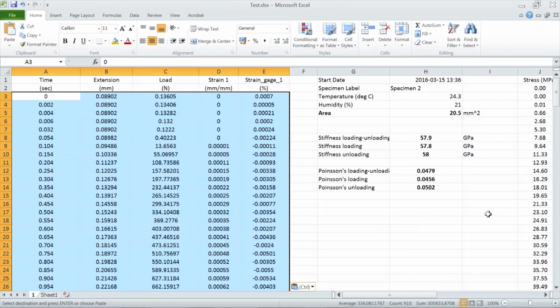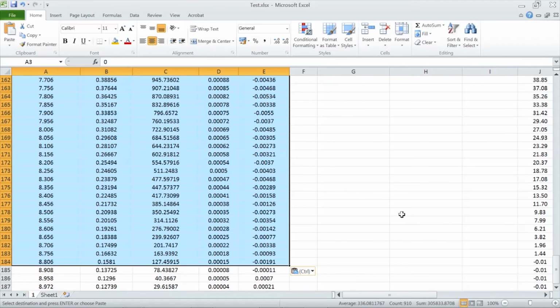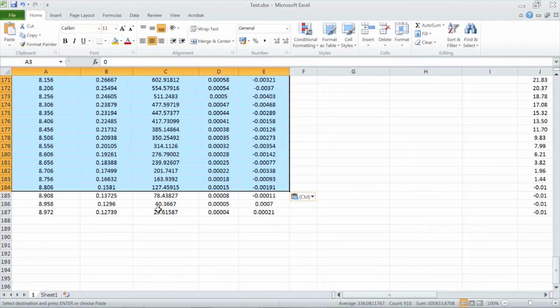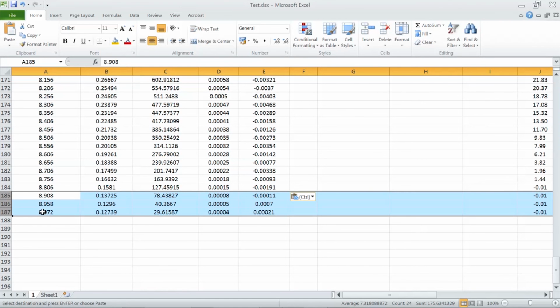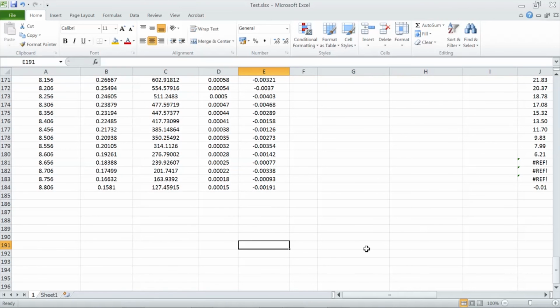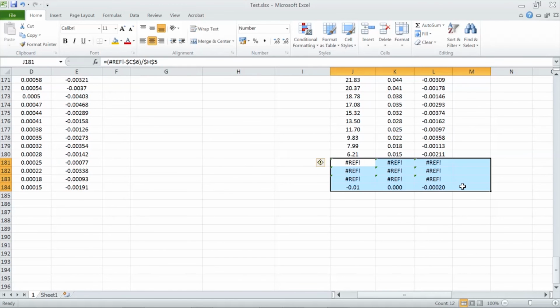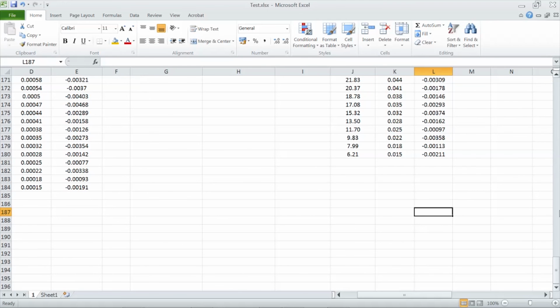However, please be very careful. Now check that you don't have residues from the old file. And you see, in this case we do. That's because the old file was slightly longer, and these are data points from the previous file, which you don't need. So what you have to do is simply remove these, because these do not belong to the same data set. So just say delete, and you get rid of that. Okay, you see we have some problems here because we deleted some of the values. That's okay, it will be fixed, but you can also remove these because this is just artificial. Remember, data sets were shifted.